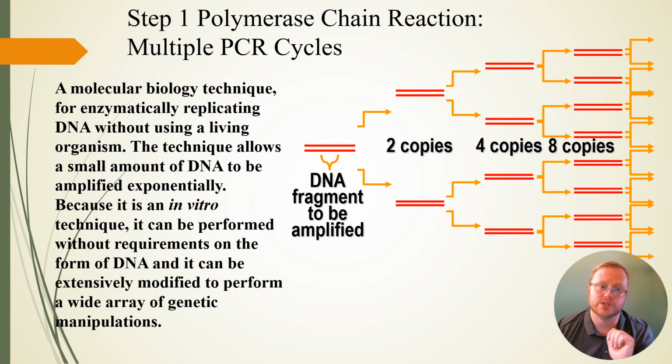So PCR is used for a lot of different things. It's used in COVID testing labs, it's used in clinical labs for other things, it's used in research. Anywhere you use DNA, there's probably a PCR instrument somewhere.